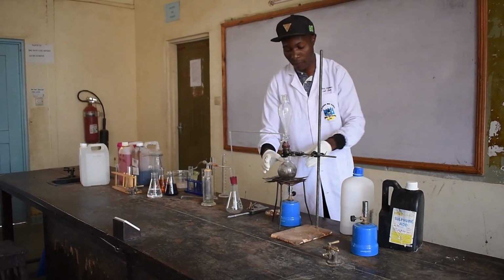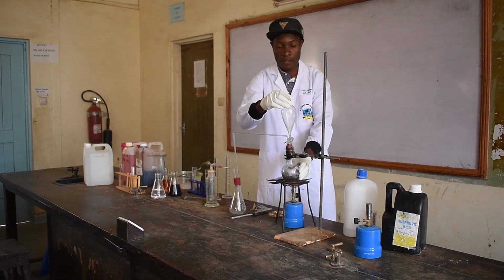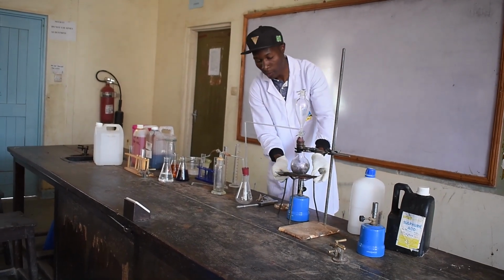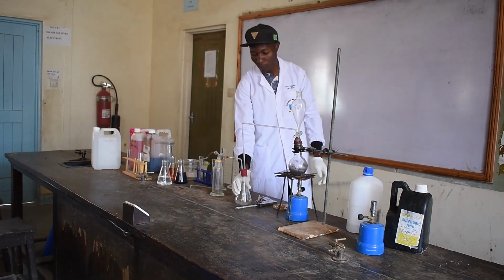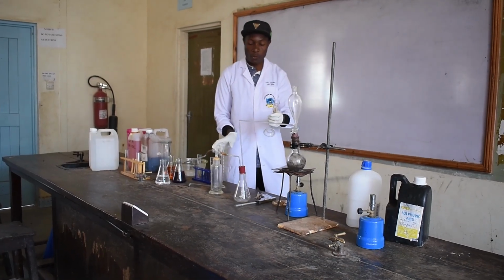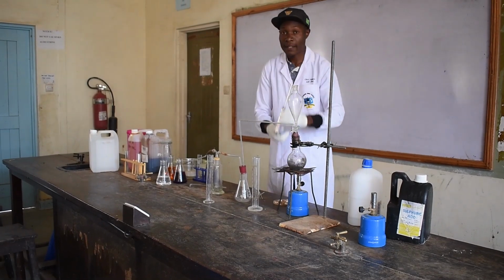We also have a round bottom flask. We have a dropping funnel. We have a delivery tube. We have a tripod stand and wire gauze. We have a conical flask. We also have a collecting gas jar. We have 2 measuring cylinders. We have a gas lighter.